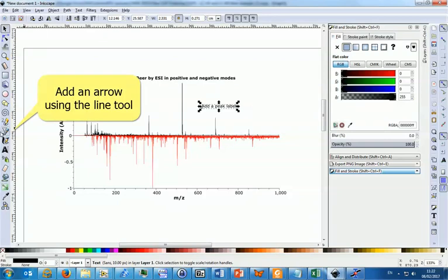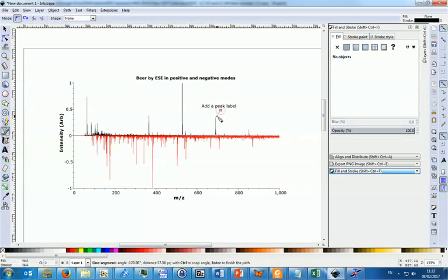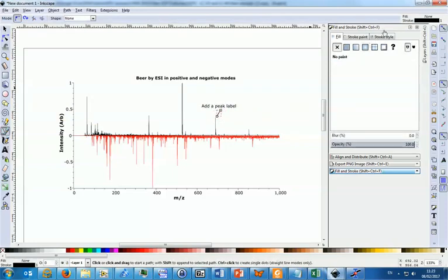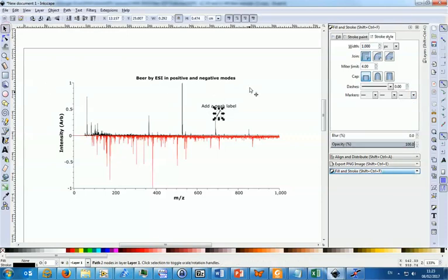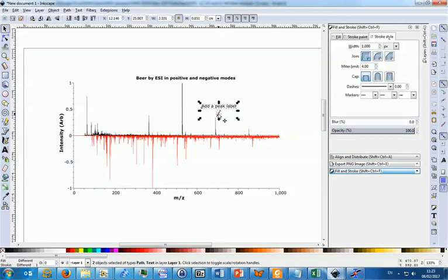Now we can also add an arrow to make sure the label points to the specific peak that's been assigned. Make as many labels and arrows as you need to label all the assigned peaks in your spectra.